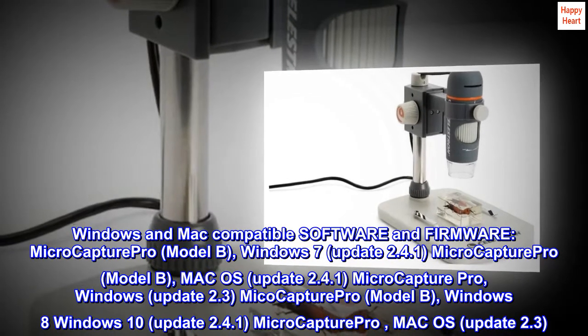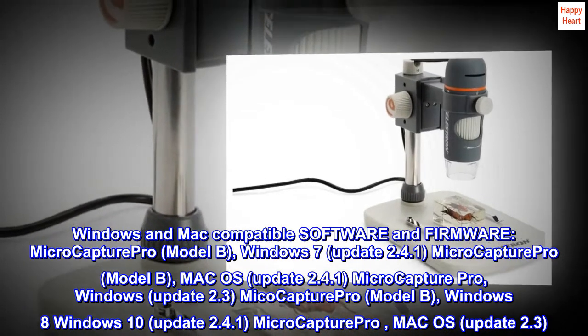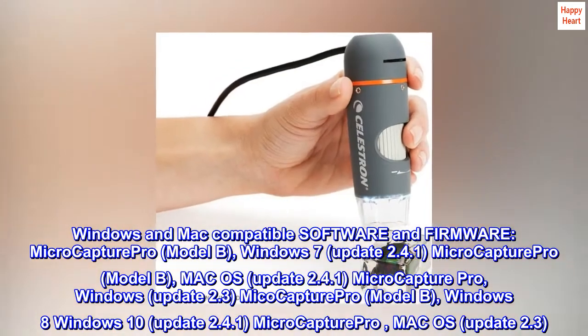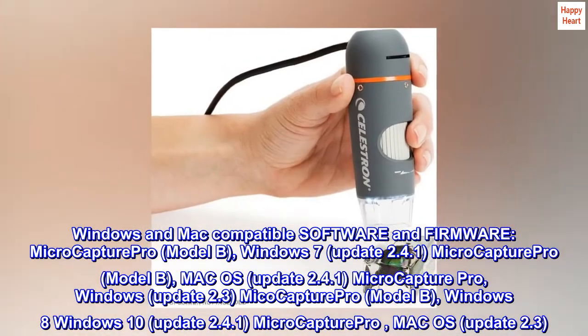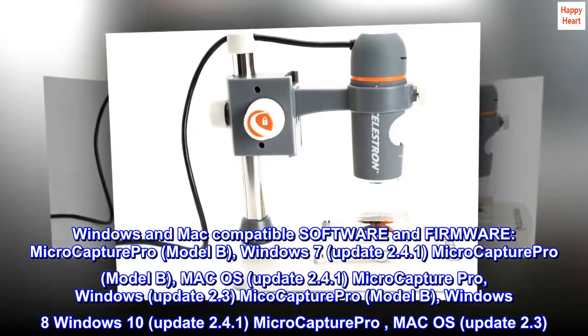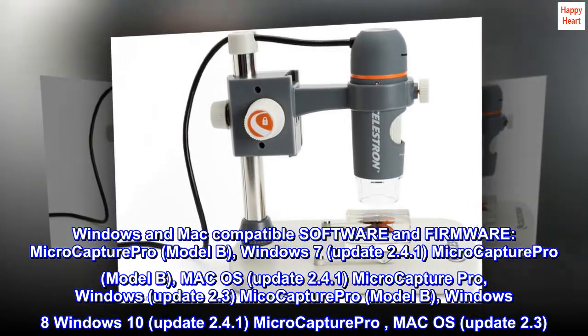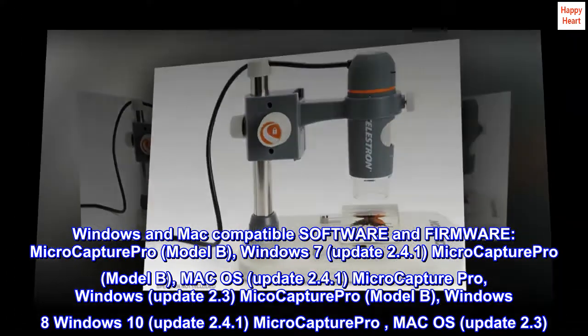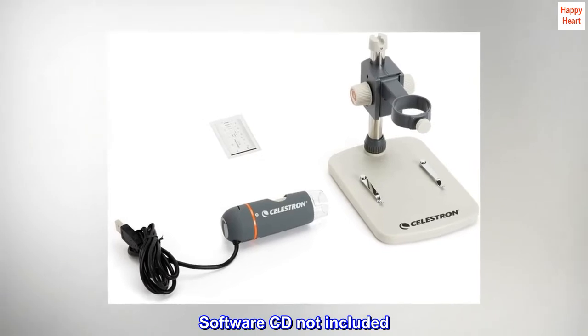MicroCapture Pro Model B: Windows 7, Windows 8, Windows 10 — Update 2.4.1. MicroCapture Pro Model B: Mac OS — Update 2.4.1. MicroCapture Pro: Windows — Update 2.3. MicroCapture Pro: Mac OS — Update 2.3. Software CD not included.